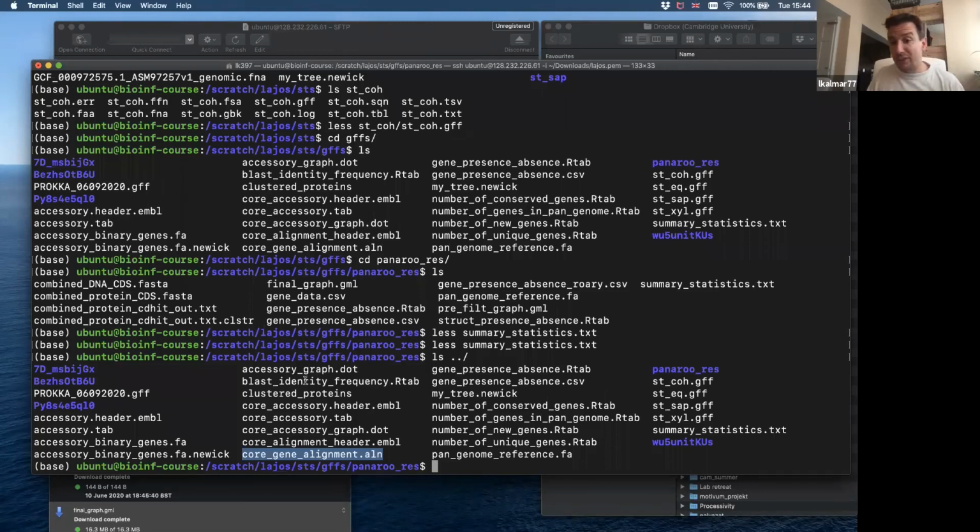So let's say that you have 200 isolates and you are looking for antimicrobial resistance or growth on a specific media. So you will have that kind of phenotype information together with, of course, all the genomes, and you want to pair these up and check what is the change that made this phenotype.